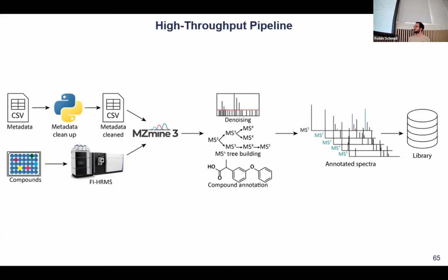Yeah, so if you want to set up your sequence, so far we're doing it on an Orbitrap instrument, but also if you're working with other instruments, we're very happy to help you set up your sequence so that in the end, all the file names contain a unique identifier for your compounds. So there's 10 compounds in there, so 10 times a structure linked to a unique identifier, and then we can measure multiple times and get multiple injections in.